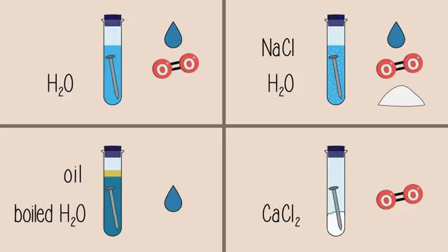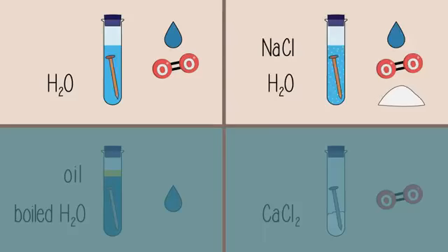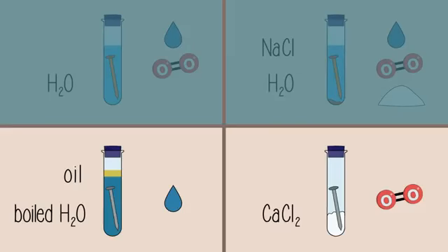You will find that the nails in the 1st and 2nd test tubes have rusted. In particular, the nail in the 2nd test tube has rusted more than the nail in the 1st test tube, and the rust has likely flaked off. You may see a reddish-brown precipitate at the bottom of these tubes. The nails in the 3rd and 4th test tubes have not rusted.